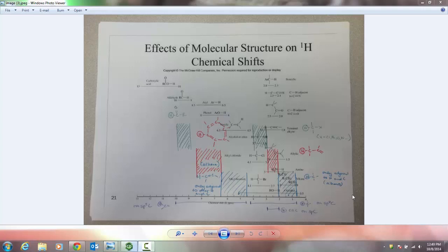In this diagram that you see before you, we are going to be looking at proton NMR chemical shifts, and then we'll move on to carbon NMR chemical shifts. And then I will proceed to give a fairly lengthy discussion of how to tell the difference between different types of aromatic rings by IR, proton NMR, and carbon NMR with examples.